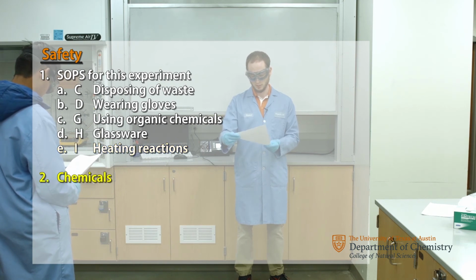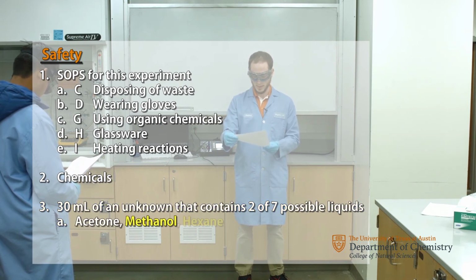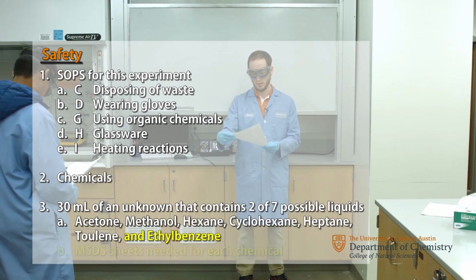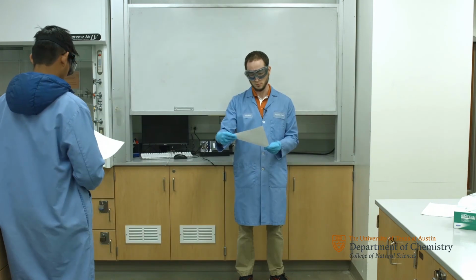The chemicals that you'll be handling in this lab, you're going to get an unknown liquid sample that contains 2 of the following 7 possible liquids: acetone, methanol, hexane, cyclohexane, heptane, toluene, and ethylbenzene. There's an MSDS sheet associated with each one of those chemicals. Make sure you know the safety hazards associated with each one.